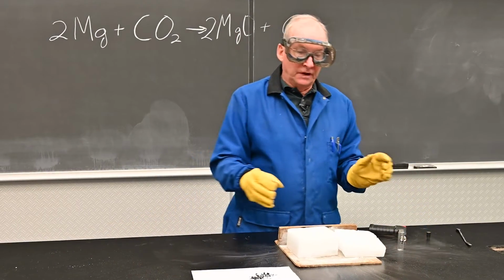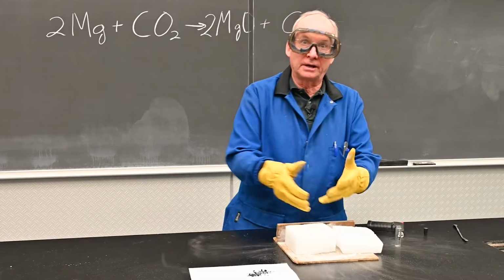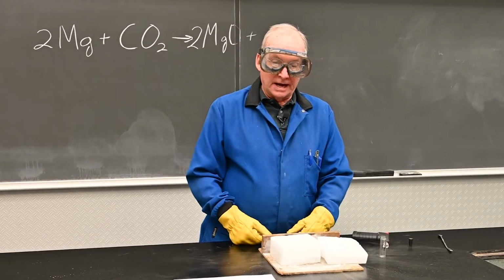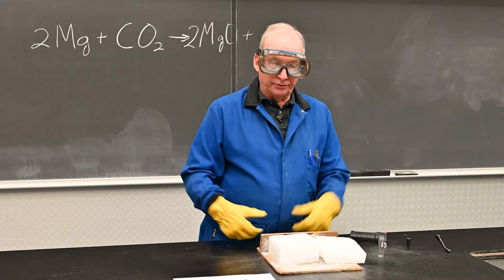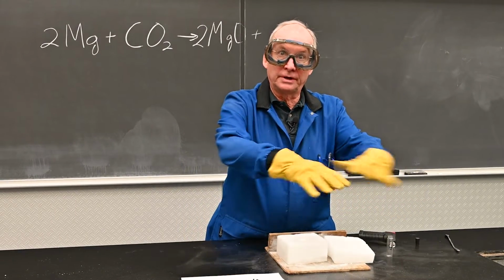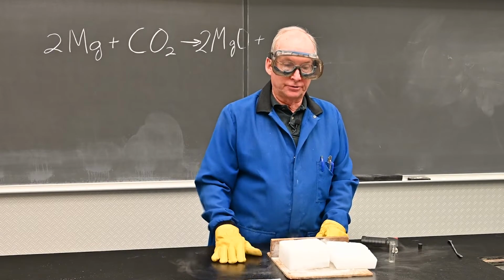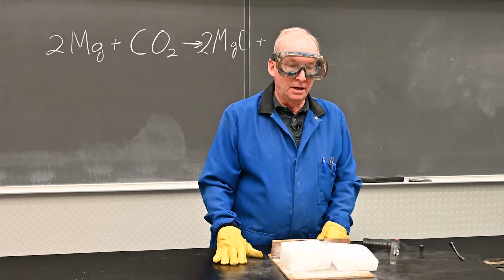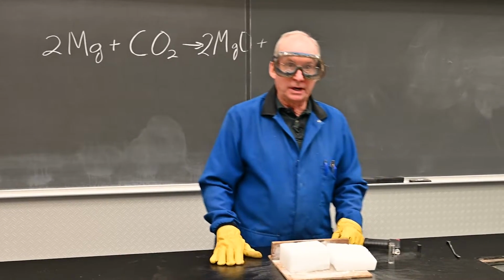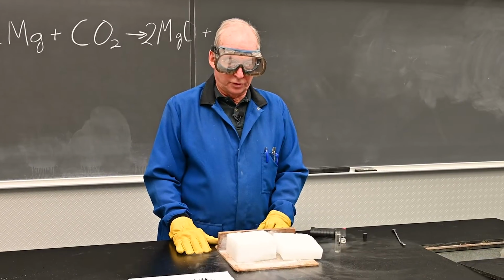And it's more convincing when you've got a big chunk and all this dry ice around here that this is burning in spite of the carbon dioxide presence. And so you could scale it down. Again, the whole parameters of open flame and what you're doing. You can see sparks are flying out there, so you don't want any flammables around it. You want a non-flammable surface, and the natural normal safety distance away. You can see it produces some smoke. We got the downdraft on over here that can pull that away, but it's a minimal amount of gas produced as a result of the reaction.